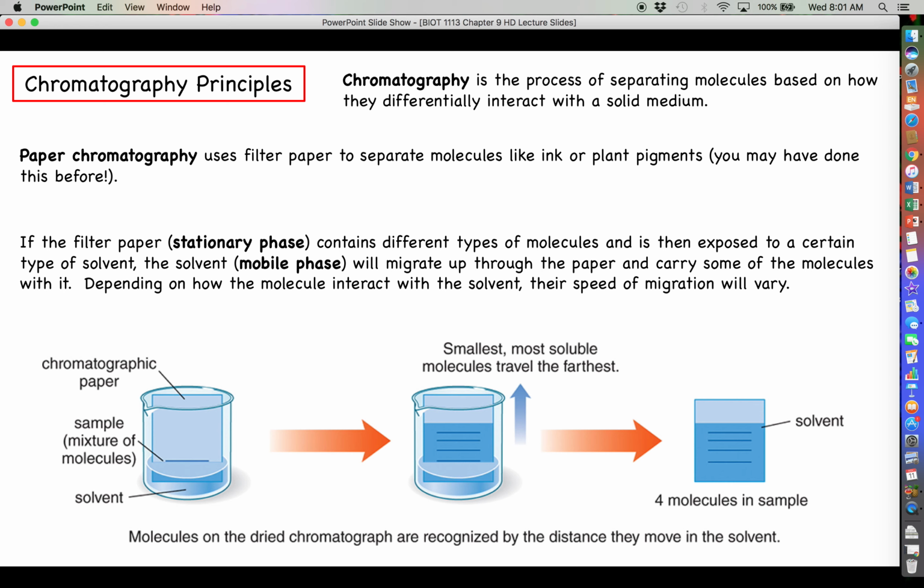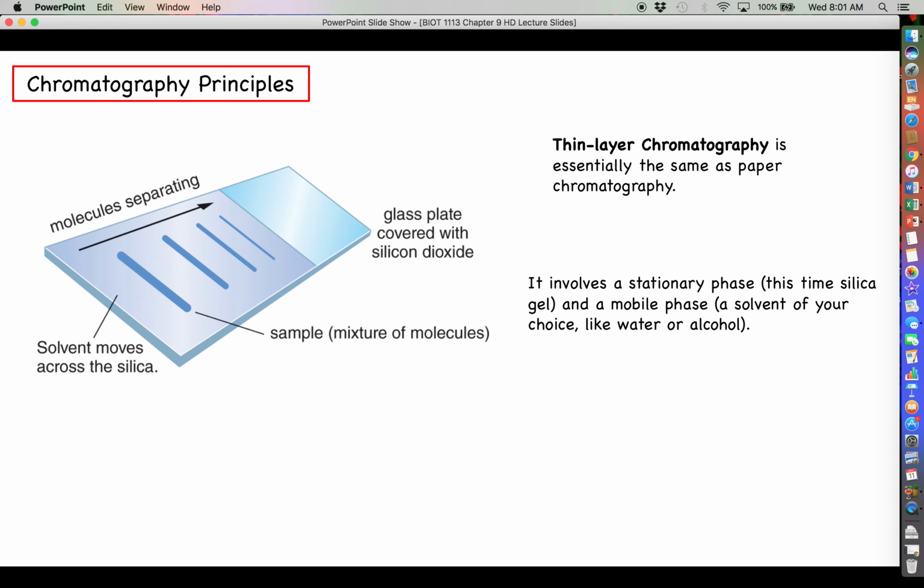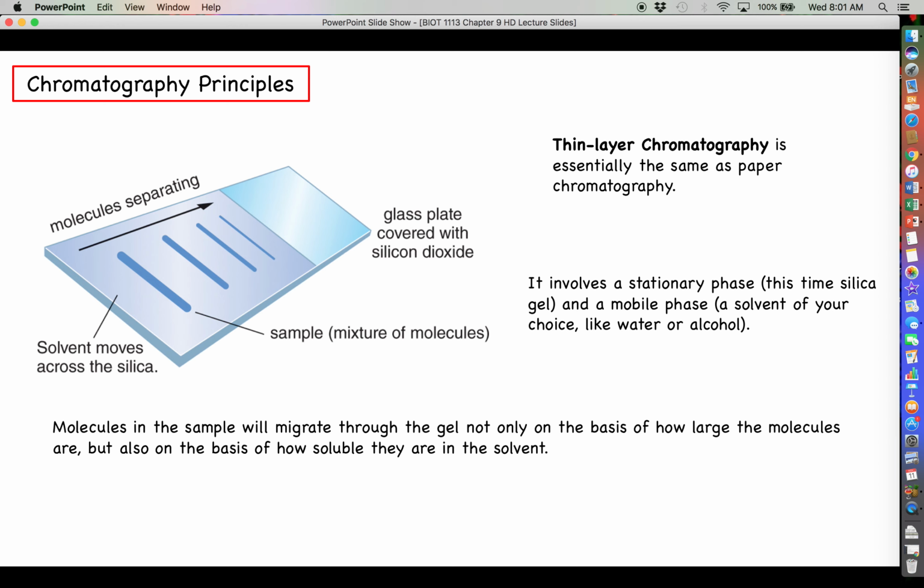Another very similar type of chromatography is called thin layer chromatography. Essentially, again, the same principles here. We have a mobile phase, which is some type of solvent. Again, it could be water or alcohol or something else. And we have a stationary phase, which instead of paper, this time is a type of silica gel. The same principles apply. Molecules in the sample, which are exposed to the silica gel towards the bottom of the plate, will migrate through the gel as the solvent moves upward on the basis of not only how large the molecules are, but how soluble they are in the solvent.